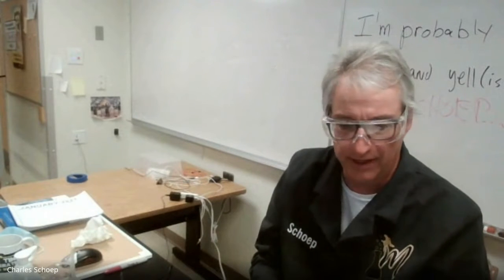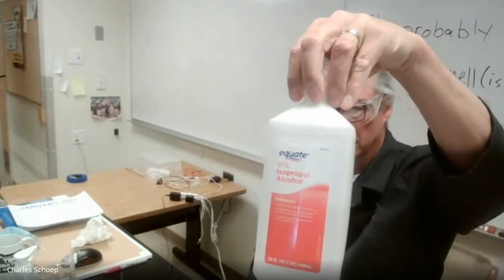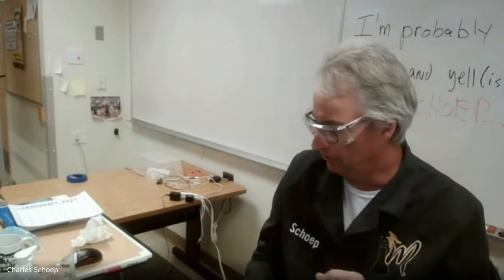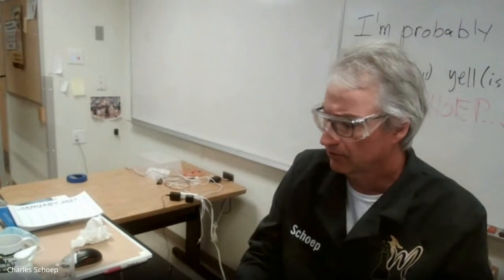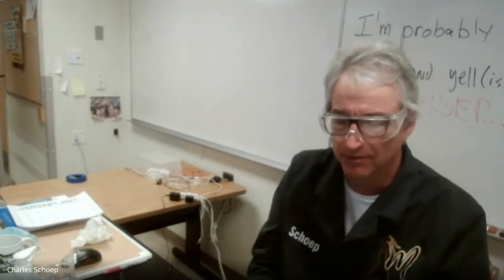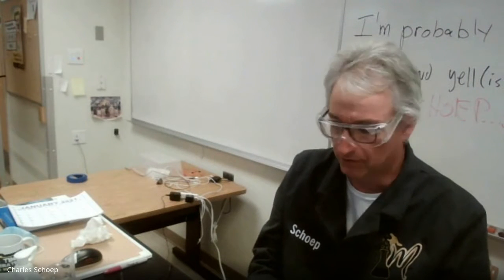So what we're going to do today is a similar setup, but instead of using water, we're going to use 91% isopropanol from my friends at the Walmart, the river from whence all good things flow. Okay. So we're going to do this in a couple of steps. I'm going to have you guys actually do more of this on your own because I want you guys to think about lab processes. And let's go ahead and get started.